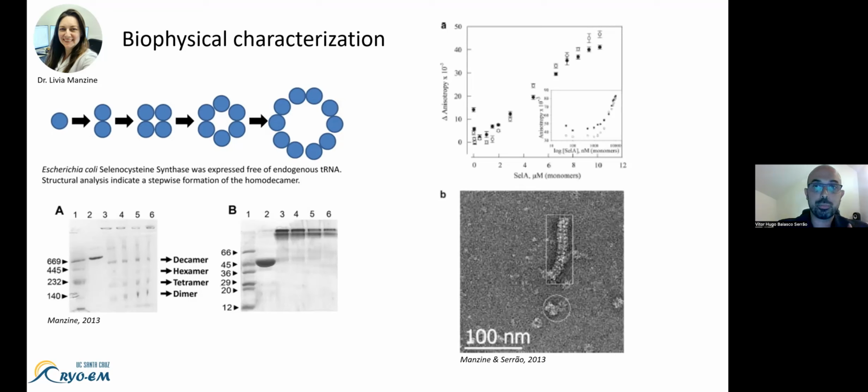So you don't see spots, but you can actually see structures that are a little random, so they don't diffract well, but they can form a crystal. And this is concentration dependent, which means in order to get a crystal, you have to increase the concentration. So it makes everything harder, right?